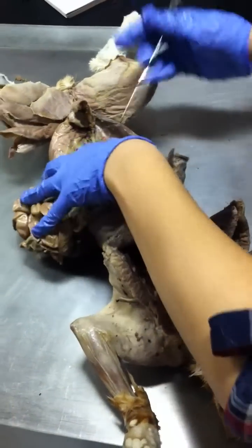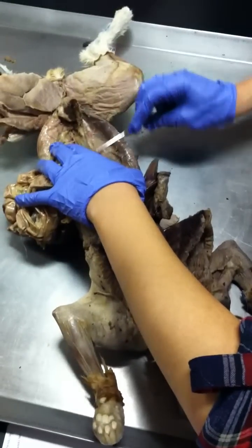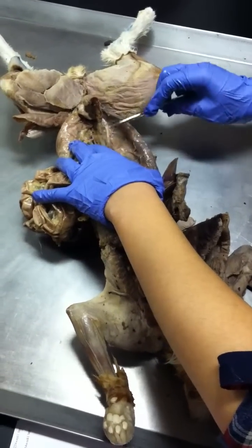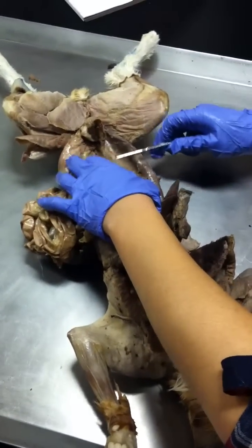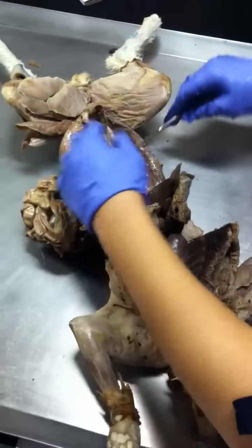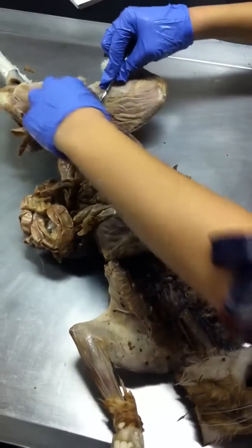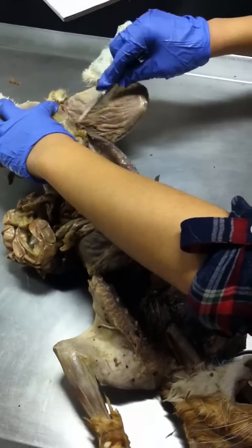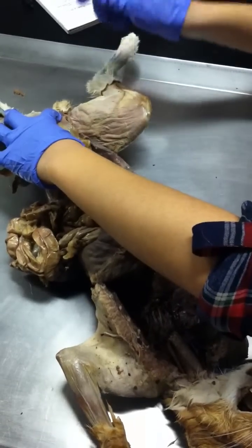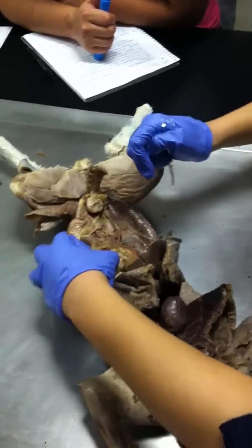Do you guys remember what this was? Kidneys. The kidneys. The white tube coming out of it is the ureter, right? It contains what? Urine. Okay. See, because it flows through it, right? This structure here is the what? Bladder. It's the bladder, right? And then what sends it out through to the outside? It's the urethra. Excellent.